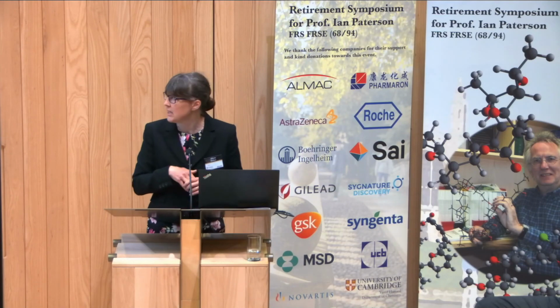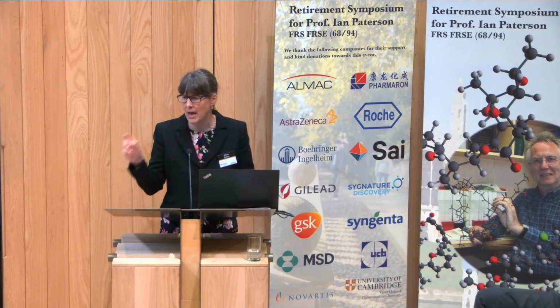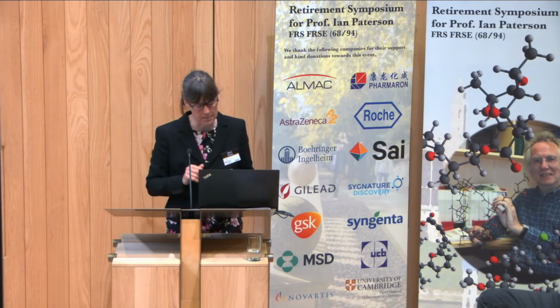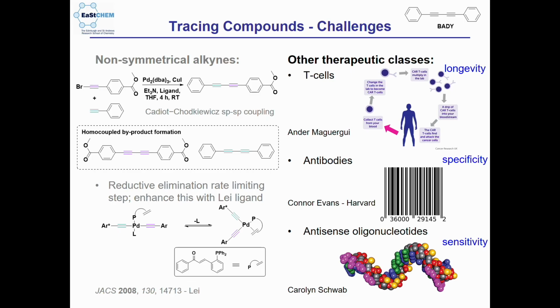We're also working at labelling antibodies with Connor Evans, who's in the Harvard Medical School. So there we want to use specificity, and we're trying to match tags to do a kind of barcoding. And we're just about to start some work on antisense oligonucleotides as well.